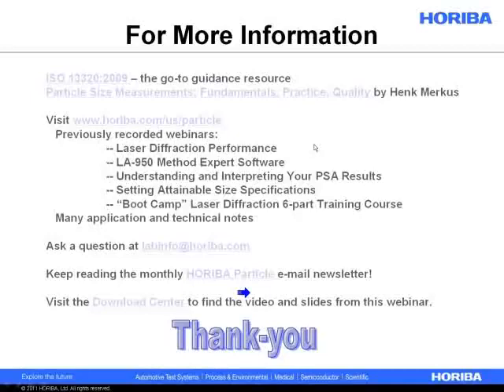When you have an inverted emulsion, water and oil, what is the best method or accessory to check the particle size? So if it's stable at many different concentrations, so dilution's not a problem, then any accessory will work with laser diffraction. That depends more on the sample quantity and how big of a pain cleanup is going to be. If you're dispersing something in mineral oil, it tends to get everywhere. You want to minimize the amount of mineral oil you're going to use.